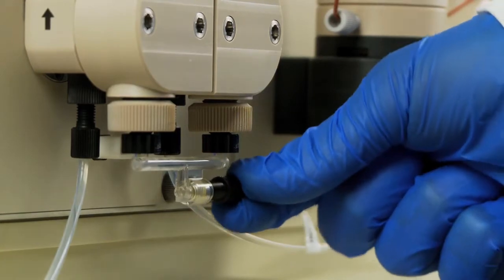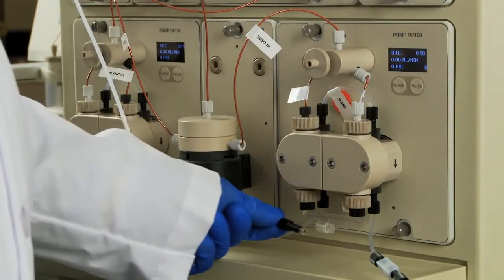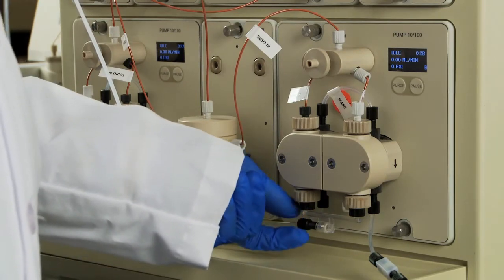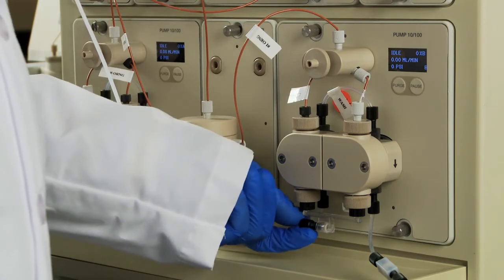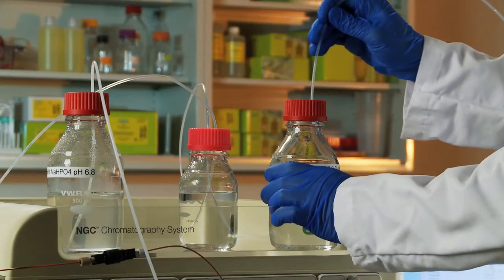Next, you will connect the buffer inlet tubing to both system pumps A and B. Securely tighten the fittings to ensure a proper seal and prevent buffer leaks. Place the ends of the inlet tubing into your buffer bottles.